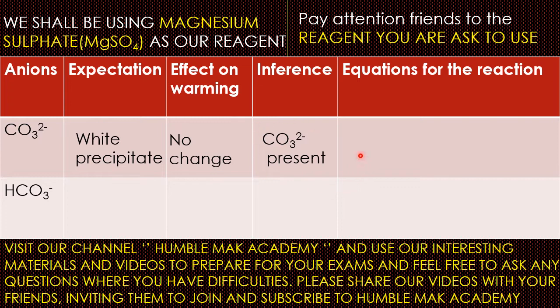Like I said, guys, on your inference booklet, you are not going to have just the carbonate ion, but rather you're going to have the carbonate ions, the sulfite ions, as well as the hydroxide ions. So you are going to write all of them down. Copy all of them down, because those are possible anions that could be present. But in this case, guys, we are looking at the test for just the carbonate and the hydrogen carbonate ions.